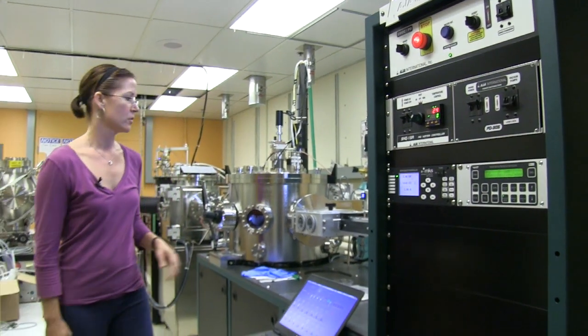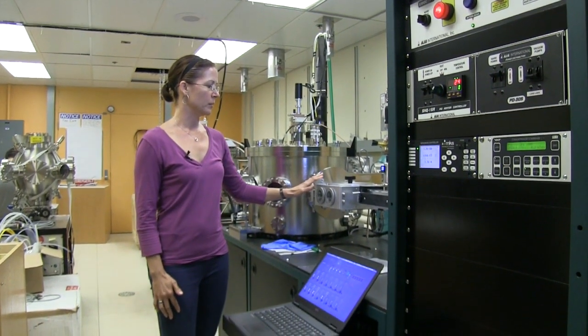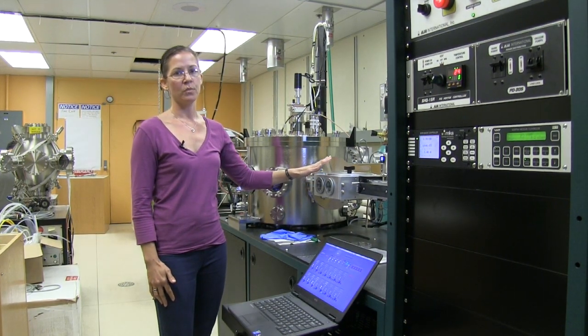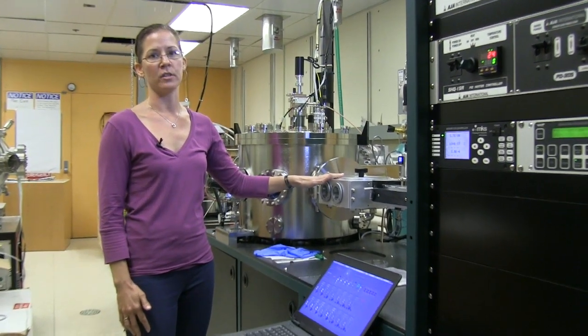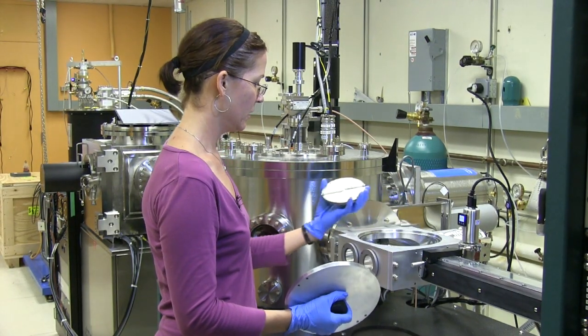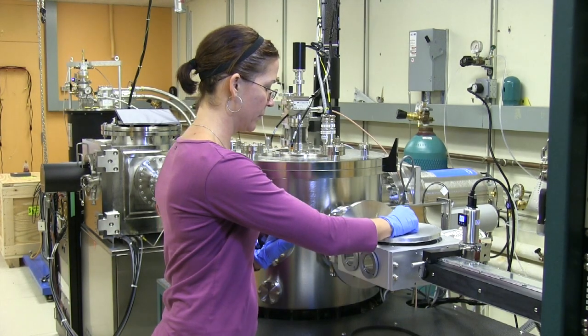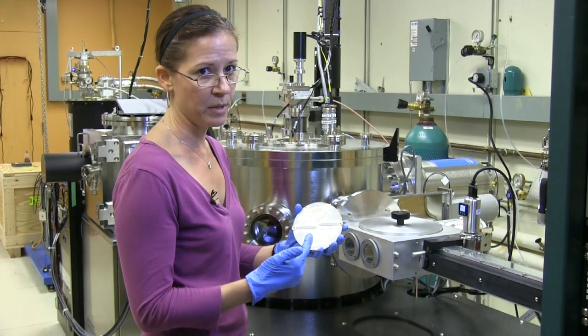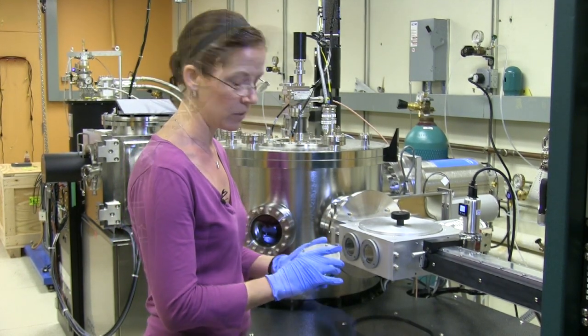So you turn those off so that the load lock comes back to sea level pressure of 760 torr. Then you pull this out — and this is the sample holder. As you can see, the sample is really tiny: half a centimeter by half a centimeter, which is what we're working with right now.